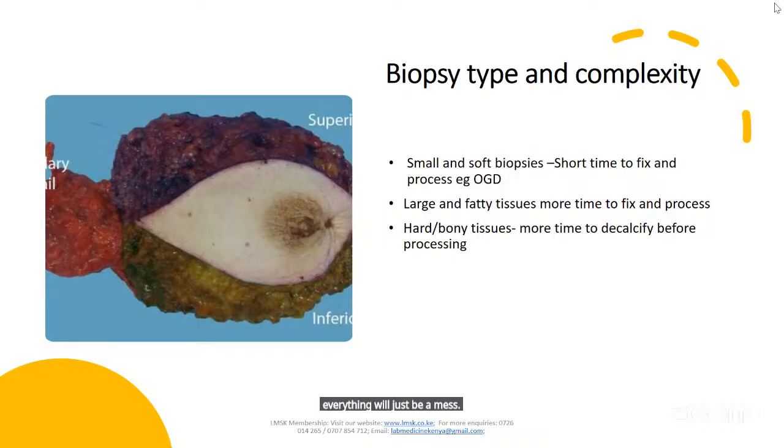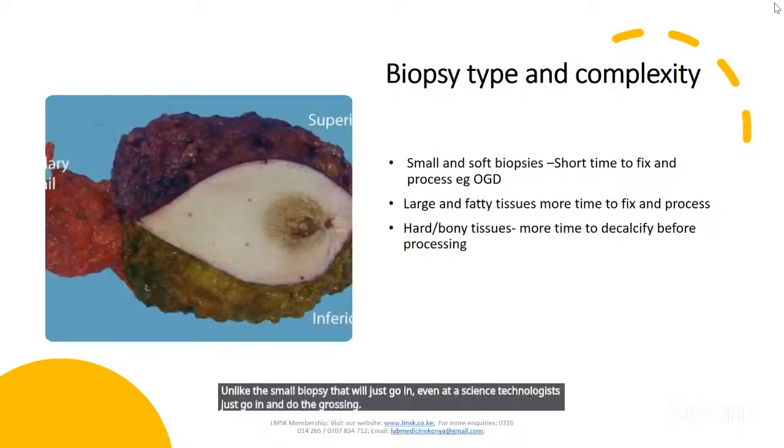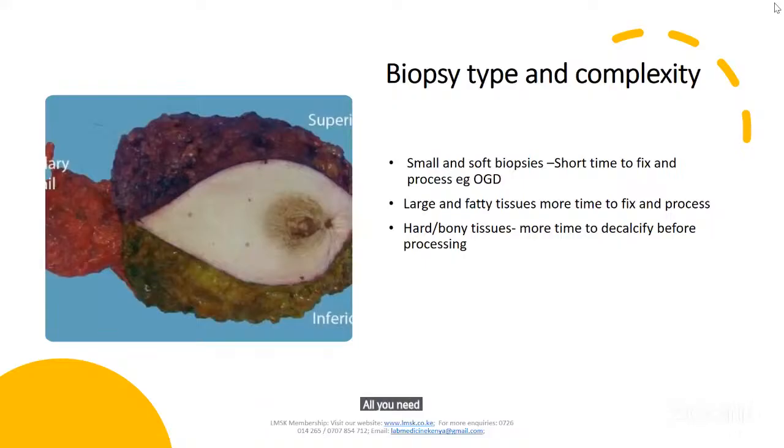So a mastectomy will take time. Unlike the small biopsy, where even a scientist or technologist just goes in and does the grossing, where all you need is to describe 3 tiny tissues aggregating to 5 millimeters, all processed in one cassette. That's okay.